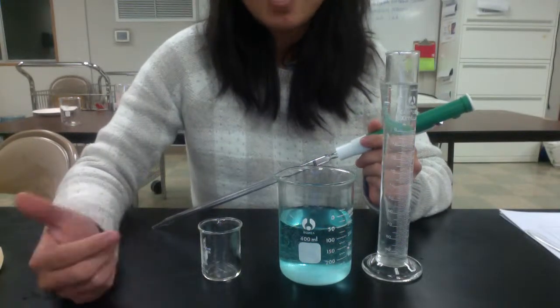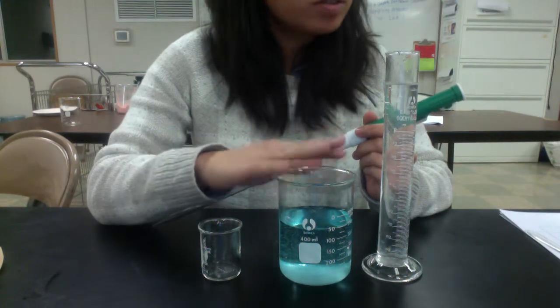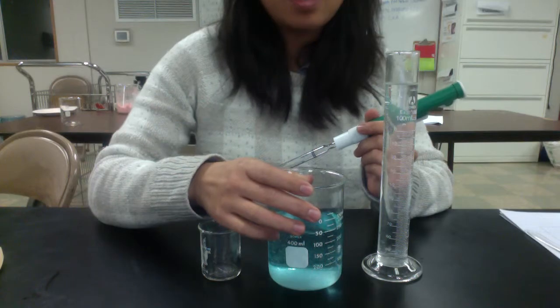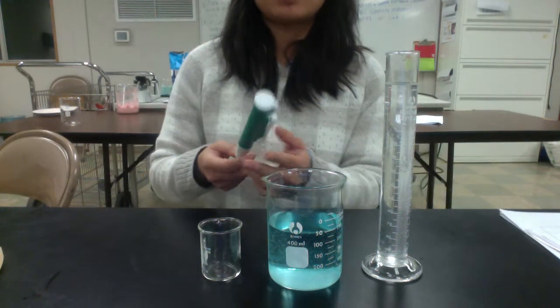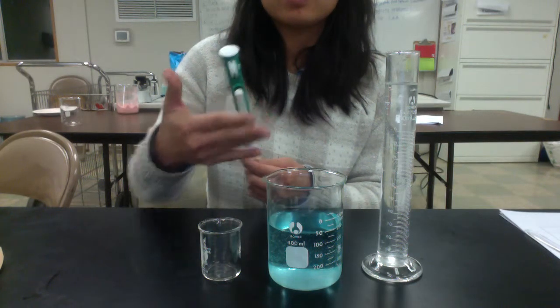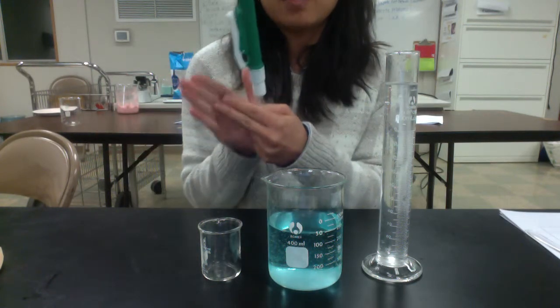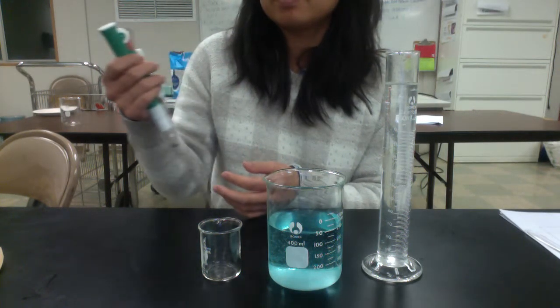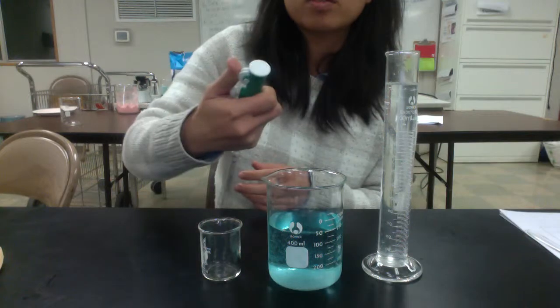So let's pretend I've already made my original IV fluids for Pam. This is my concentration. And next I'm going to need to learn how to use this, which is my pipette. The way you hold it is the inside of your forefingers go here, and then your thumb goes on top.